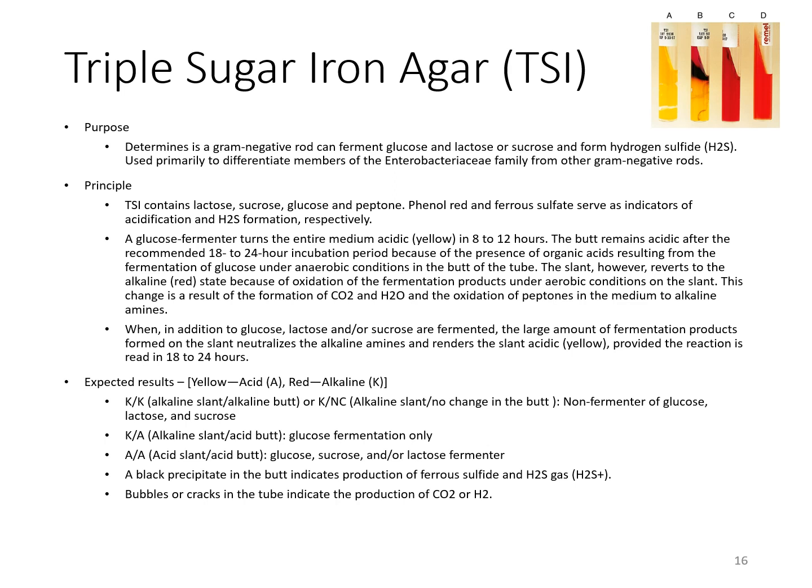If glucose is the only sugar that's fermented, then there will be a small amount of acid production on the slant that will be oxidized to a more neutral product. So it'll go from an acid appearance, which would be yellow, and then it would go back to a red appearance, just where it would be in the presence of the oxygen, and it would remain at an alkaline state. Whereas within the butt, there's no oxidation, so it would not revert back, so that butt would remain yellow.